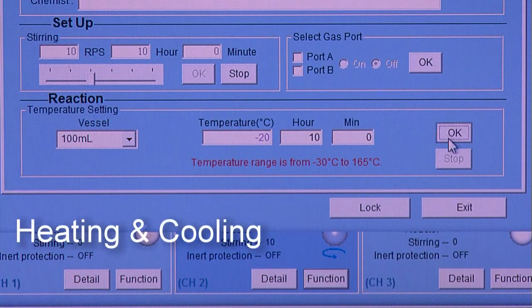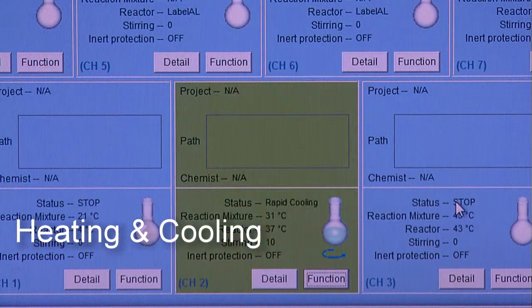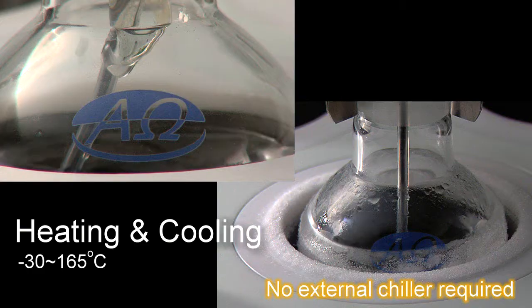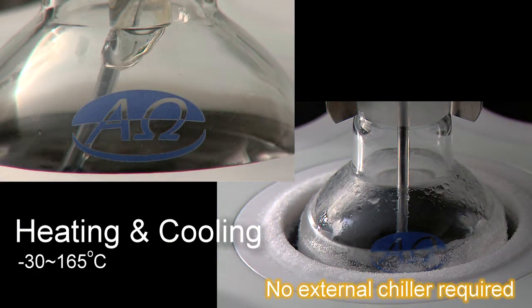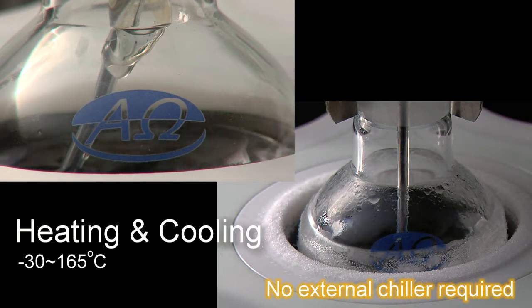Just set your desired temperature in Pro7 Pin. Pro7 then precisely controls the reaction temperature from minus 30 to 165 degrees Celsius.